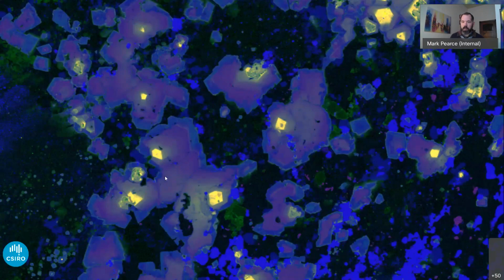We can also see much smaller pyrites in here, and the iron oxides in the bright blue color. So these rocks have experienced a magnetite flooding, and we can start to see when that occurs with respect to different generations of pyrite, because the magnetite is limited to the very outside zones of the pyrite. For example, this magnetite grain here abuts the corroded edge of this pyrite.